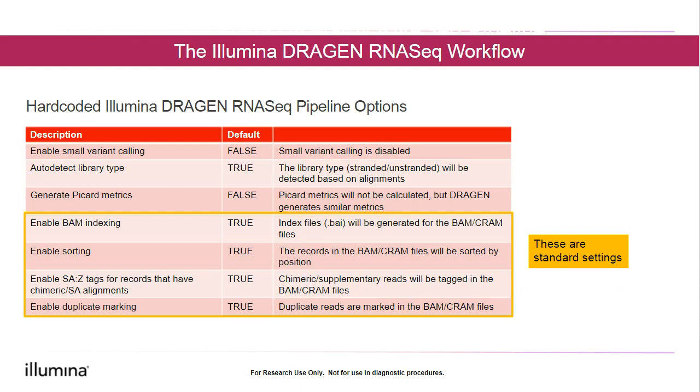These are the hard-coded options for DRAGEN RNASeq. You'll notice that the standard settings are the same for DRAGEN Enrichment. Duplicates are reported but are not excluded from downstream analysis.